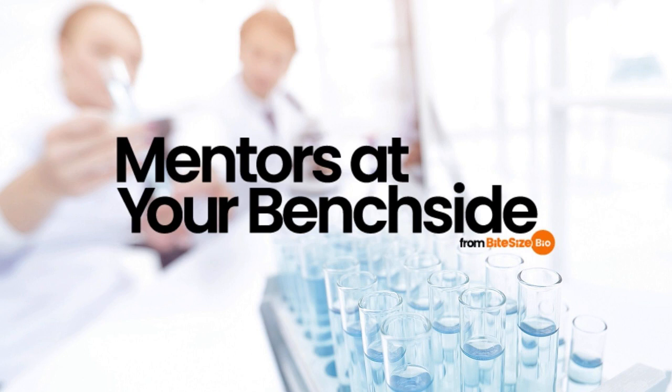So, is any measurement ever truly 100% accurate and precise? Here's the bad news. While being 100% accurate and precise is clearly ideal, it is impossible in reality. There is always some non-zero variability from factors outside of our control, such as the instruments, environmental conditions, and lab personnel. With that said, there are many things we can do to maximize accuracy and precision when conducting experiments.